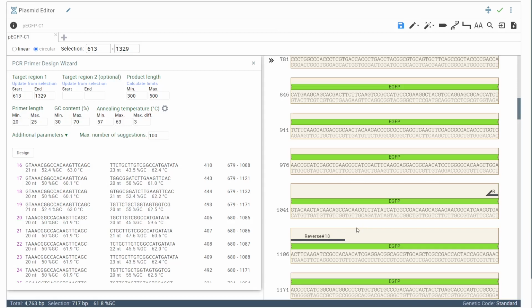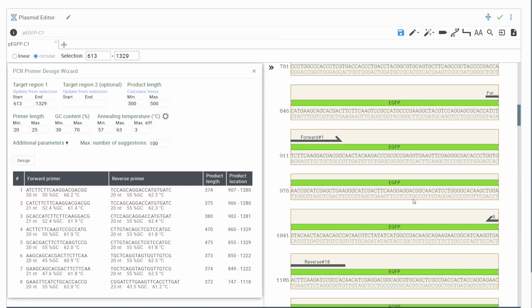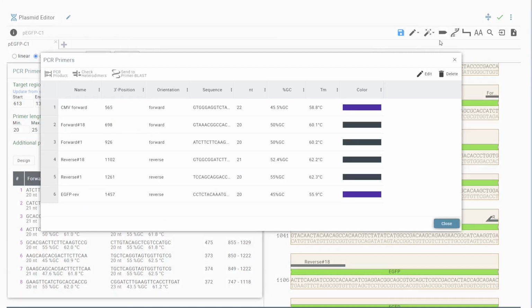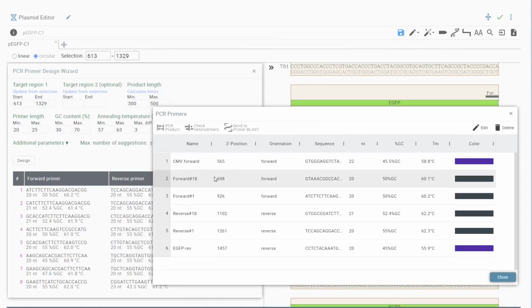This is the way the results are saved actually. So you have to pick a primer pair or more and click the magenta line number to annotate the primer pair in the sequence. You can then modify the names and other properties of primer annotations in this dialog. You can also see the predicted PCR product if you select the primer pair using click and control key plus click and pressing this button.